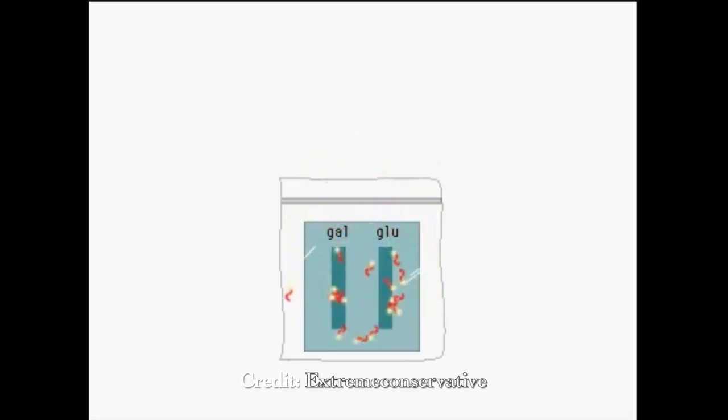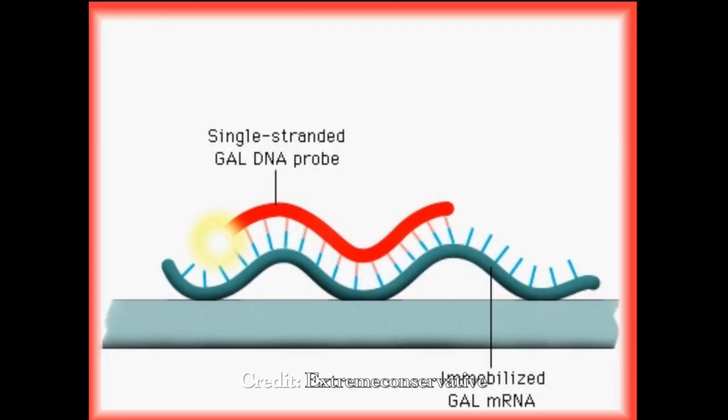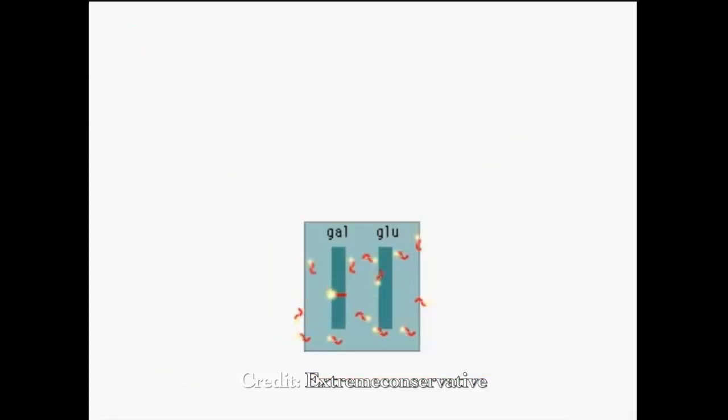For it to work, the probes will have to be complementary to the RNA sequences of interest, the RNA sequences you're trying to target. And if you're familiar with electrophoresis in the protein setting, it's very similar, because here you will wash the RNA to remove any unbound probe, and then the membrane will be exposed to an X-ray film, and this generates what we call an autoradiogram.